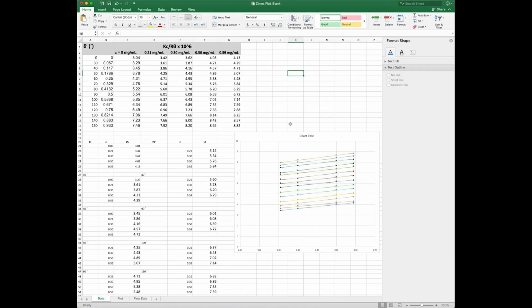So at this point, I've done 2 extrapolations, and I'm showing the most recent one here. But what I did is I plotted on the x-axis the scattering angle, or actually I plotted sine squared of theta divided by 2, so that's this column here. So these are my x values. And then I plotted every single concentration. So I plotted this data, and this data. And I looked for the y-intercept. And the y-intercept gave me the scattering intensity at 0 angle. That is, if I'm looking at the laser, what's the scattered intensity? And that's something that I can't measure. It's impossible to measure that.